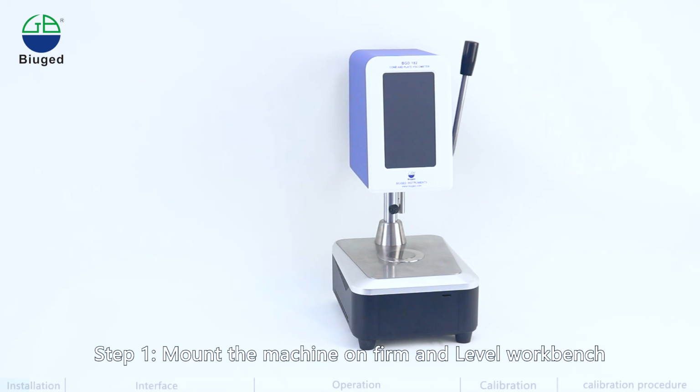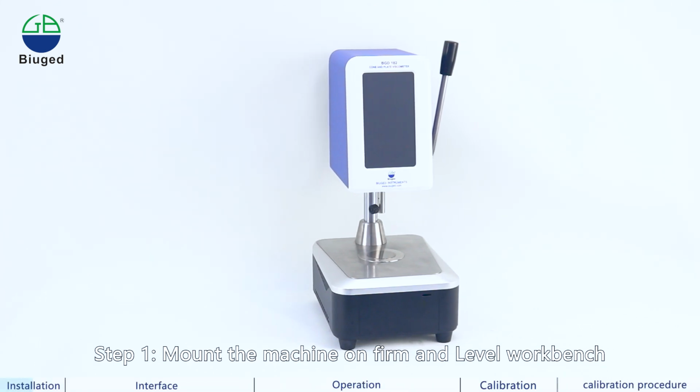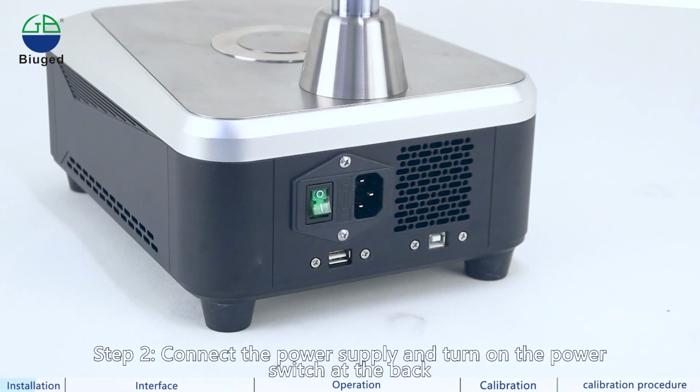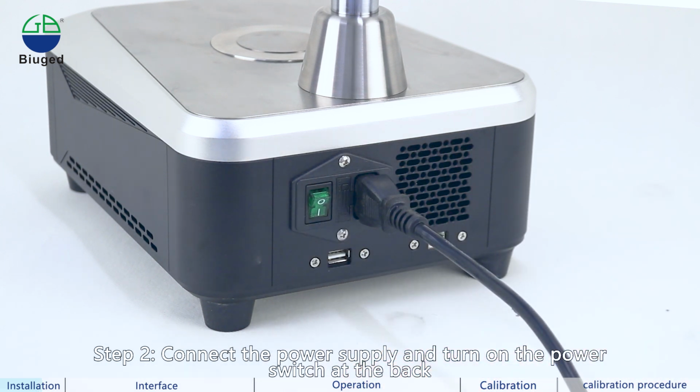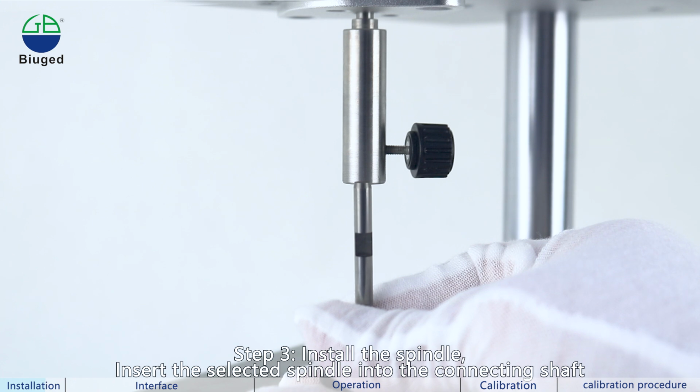Step 1. Mount the machine on a firm and level workbench. Step 2. Connect the power supply and turn on the power switch at the back. Step 3. Install the spindle.